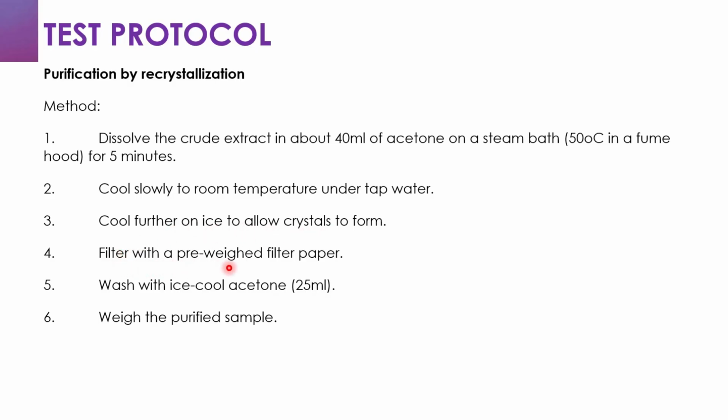We filter with a pre-weighed filter paper. We wash with ice cold acetone, about 25 ml. Then we weigh the purified sample.